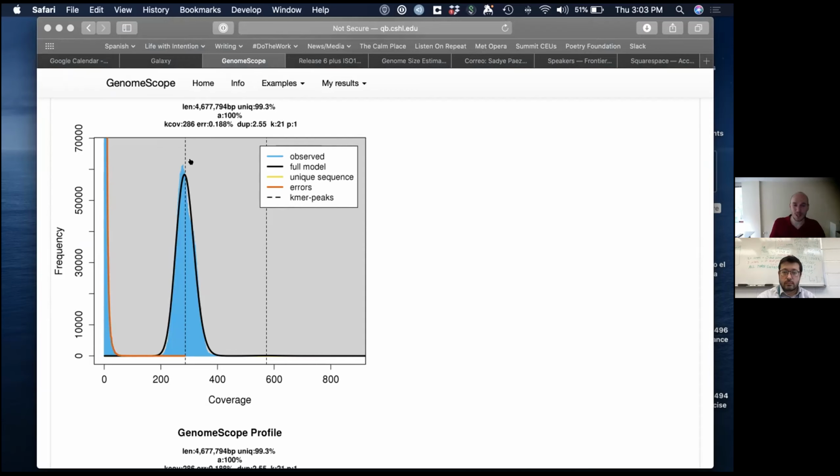So in the real world situation, the data does not follow exactly the expectation, and you may end up with results like this. Also, you can see here is a very high coverage, of course, because when we sequence, or whoever sequenced this data set, which is E. coli, even with a relatively low throughput machine, you get a ton of coverage for it.